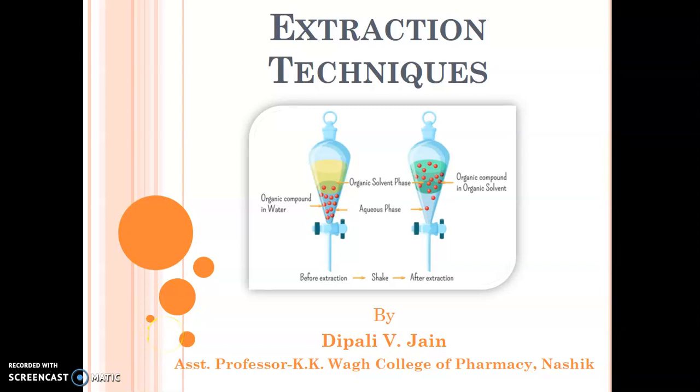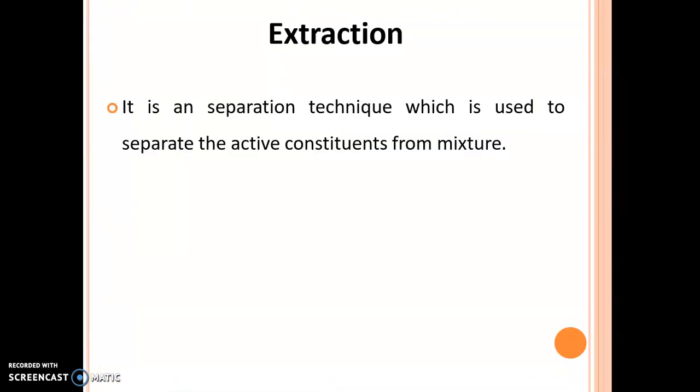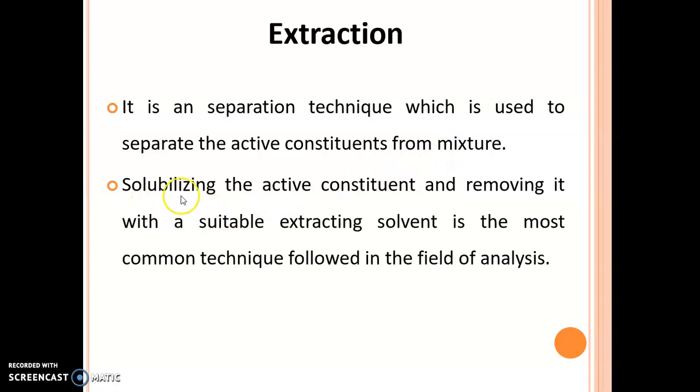So let us start with the definition of extraction. So what is meant by extraction? It is the separation technique which is used to separate the active constituent from a mixture. Solubilizing the active constituent and removing it with a suitable extracting solvent is the most common technique followed in the field of analysis. Okay, so this is the definition of extraction.